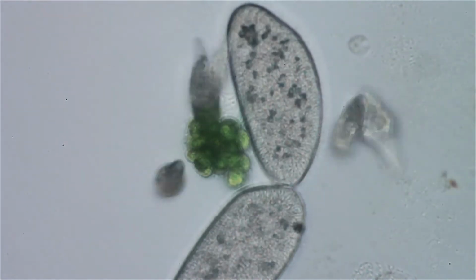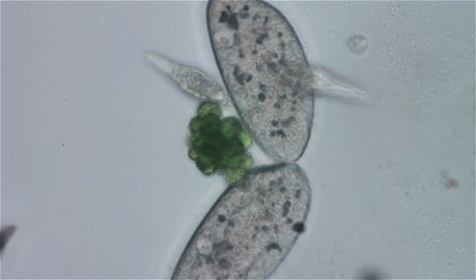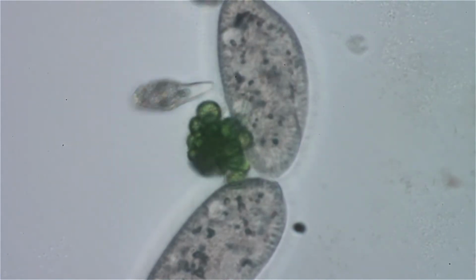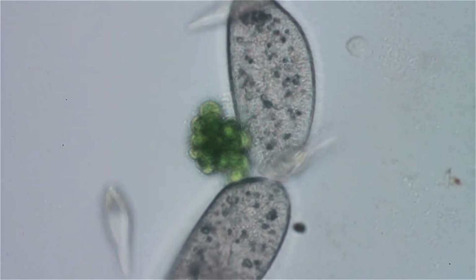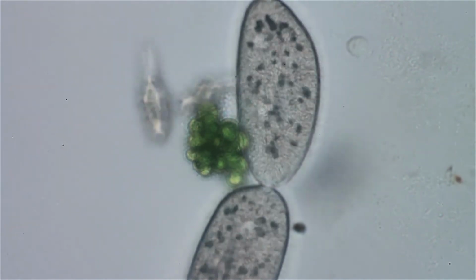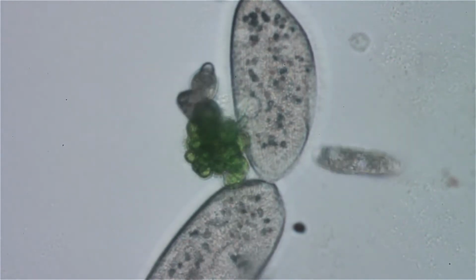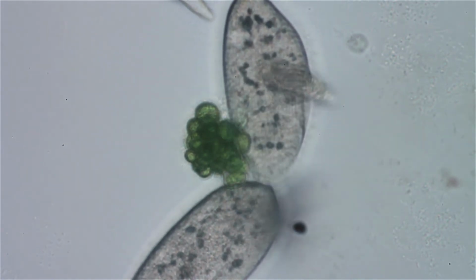Here you'll be able to see the mouth when he rolls over. The mouth and the oral groove. And these Khawkineas seem to be taking an interest in either him or that algae. I don't know what the draw is there. Or possibly it's just the light spot coming through the slide and up into the lens. That's why they're there. You see the mouth and the groove kind of starting to form there. It's not complete yet. It's got vacuoles. There's the vacuole emptied out.